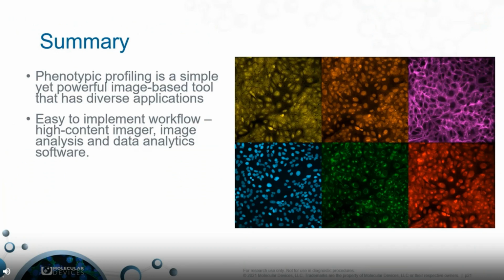And so to sum up, I would like to recap some of the main points from this part of the presentation. I hope I've convinced you that phenotypic profiling is a simple yet powerful image-based tool that has diverse applications. The workflow that I've shown is easy to implement. You just need a high-content imager, image analysis software, and data analytics software.